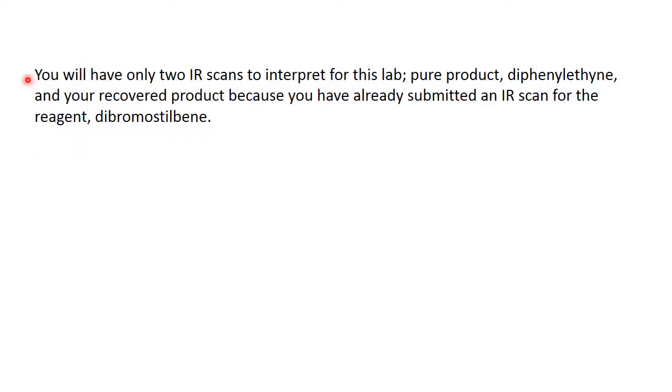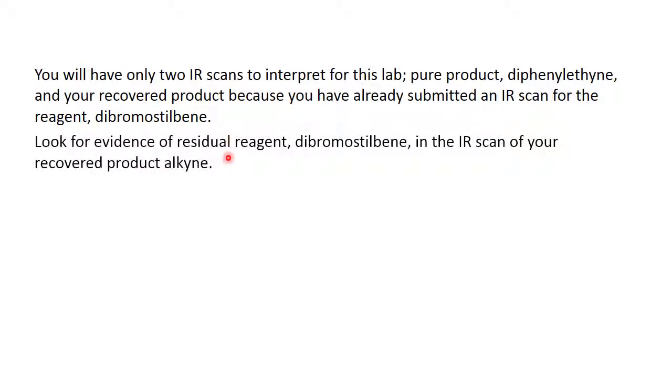So you will only have 2 IR scans to interpret for this lab, the pure product diphenylethyne and your recovered product. And this is because you've already submitted an IR scan for the reagent dibromostilbene. So look for evidence of the residual reagent dibromostilbene in the IR scan of your recovered product, alkyne. And that's it. I hope that helps.